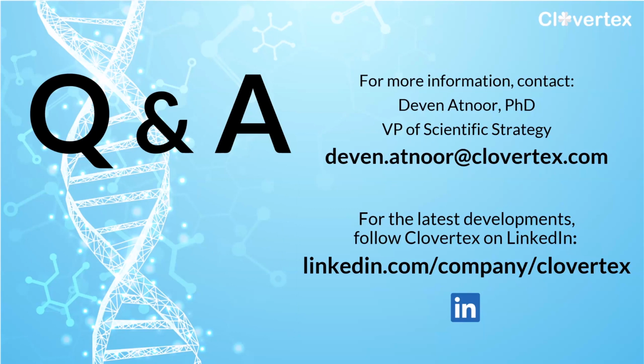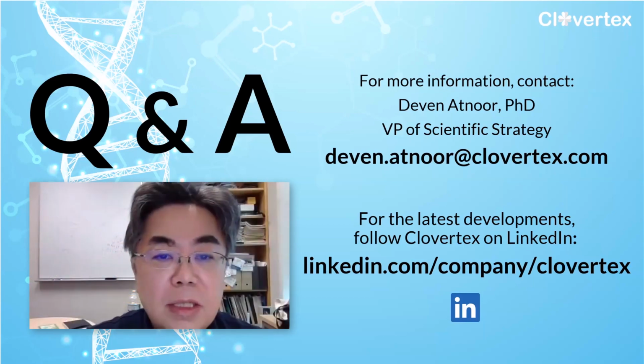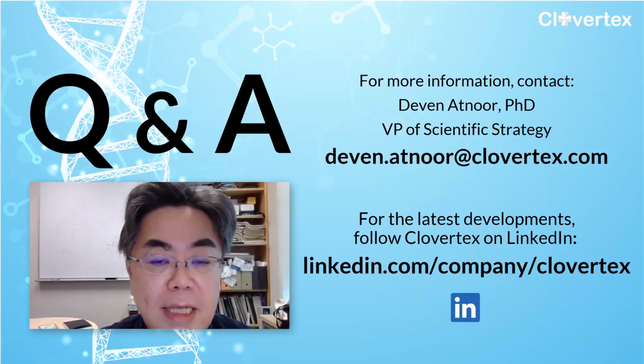Okay, and one last from Vadim. Can cryo-read handle protein nucleic acid complexes? Right, so cryo-read is only for nucleic acid structures.